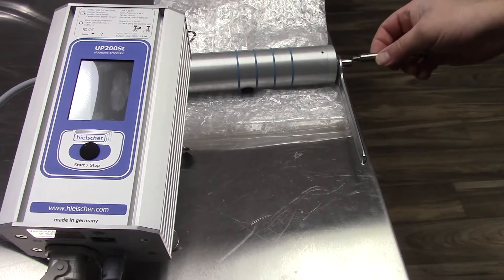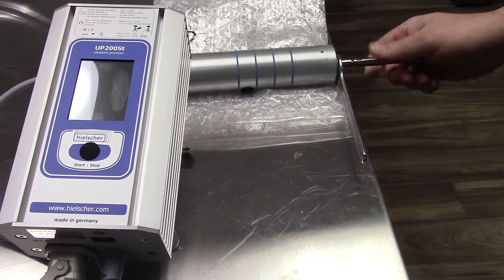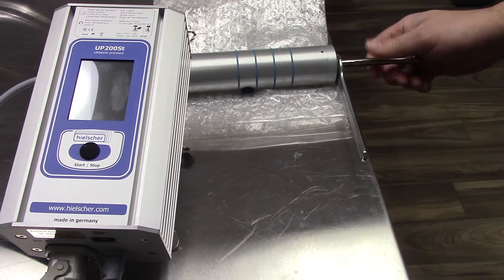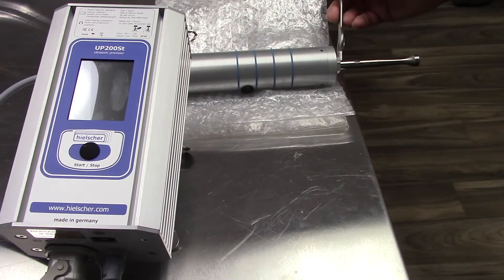For mounting, it's the exact opposite. Turn the sonotrode in clockwise. Position the wrench on the other side.